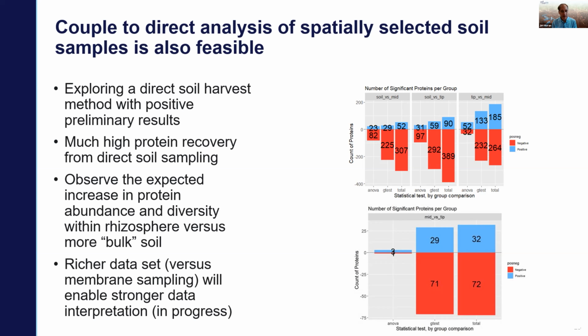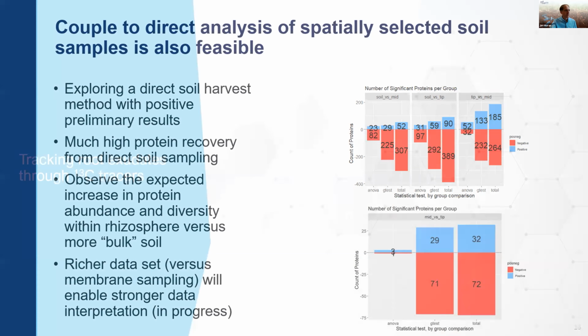So if you have Rhizoboxes or maybe even field systems, basically all you need to do is harvest that tiny amount of soil, put it in a sterile tube, freeze it, and send it to us, and we could perform this type of analysis with it.